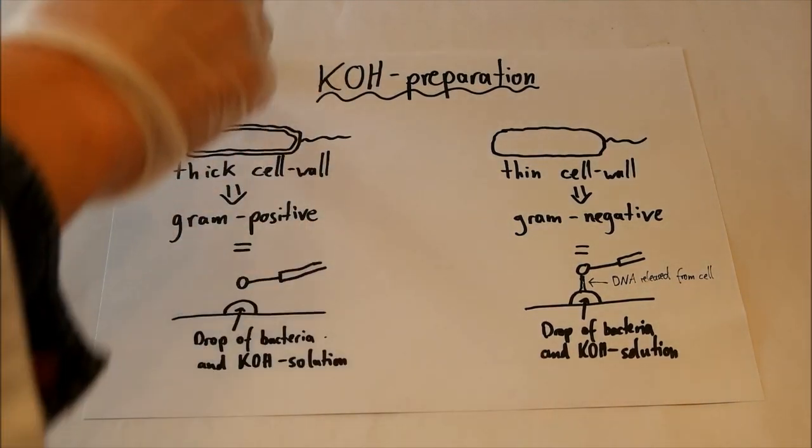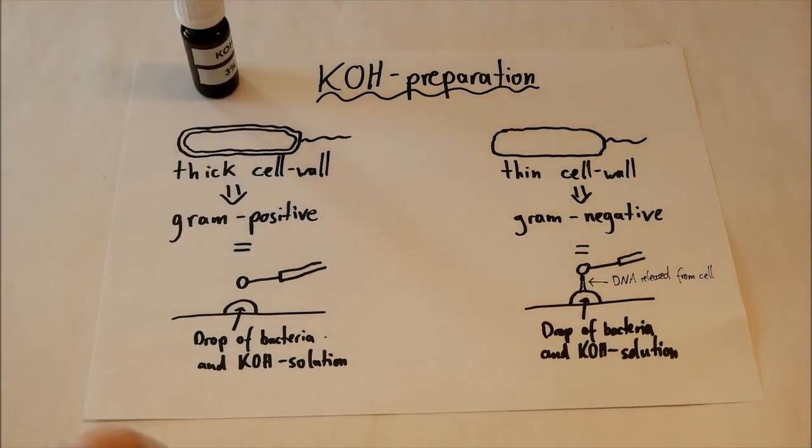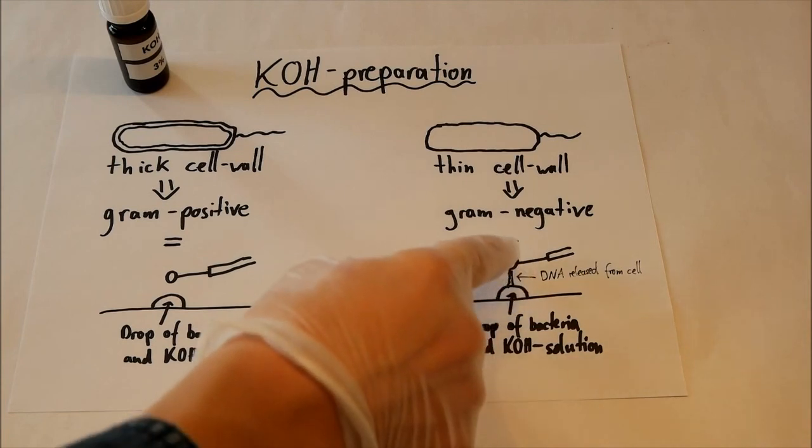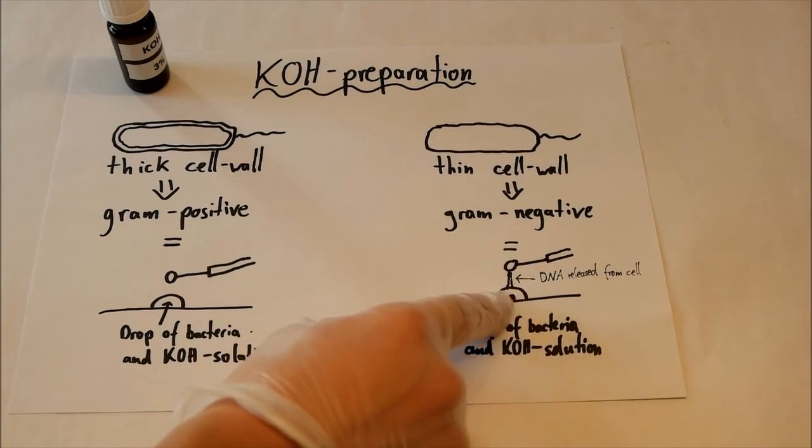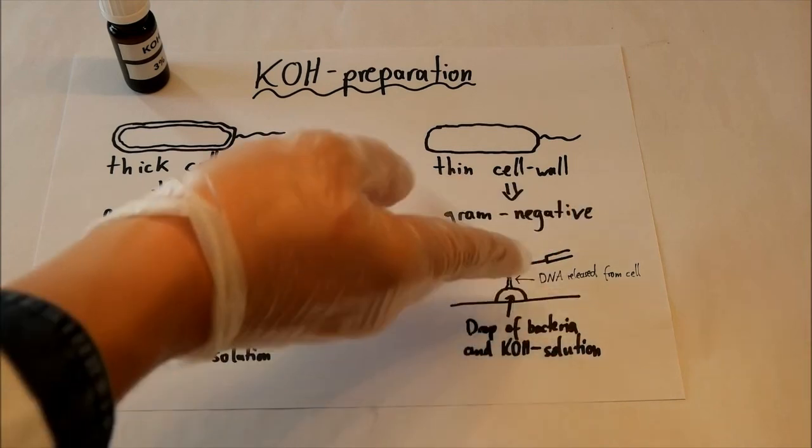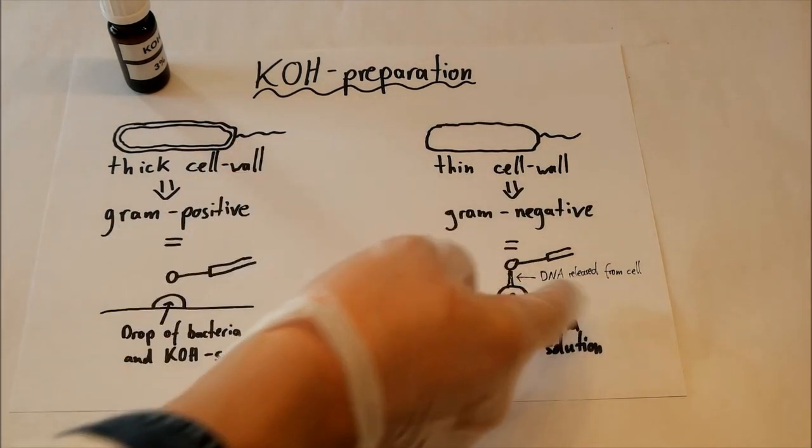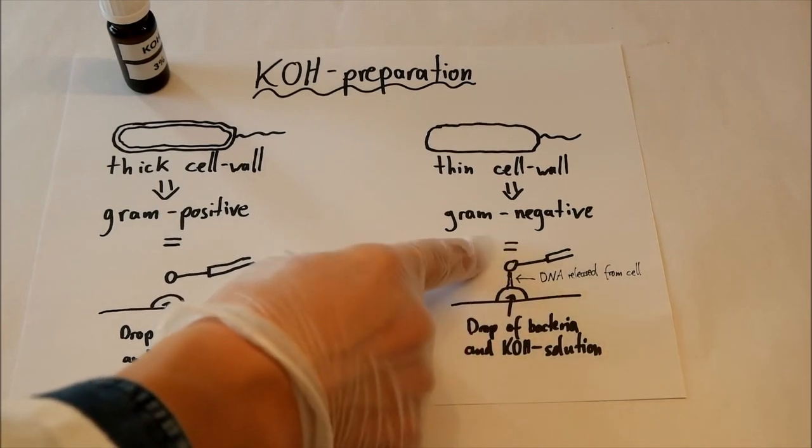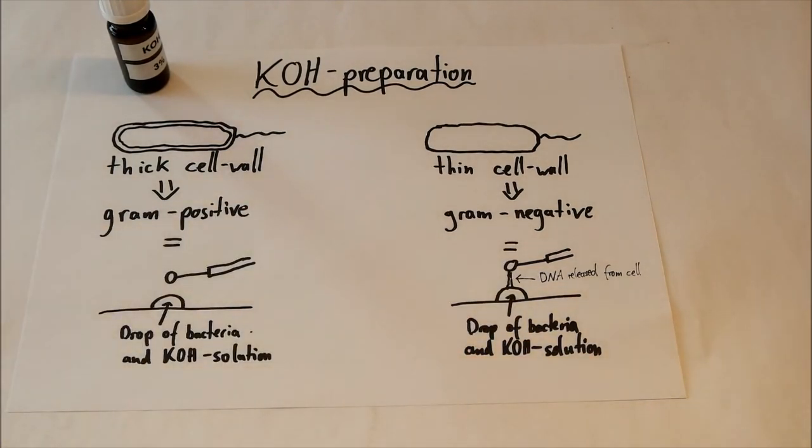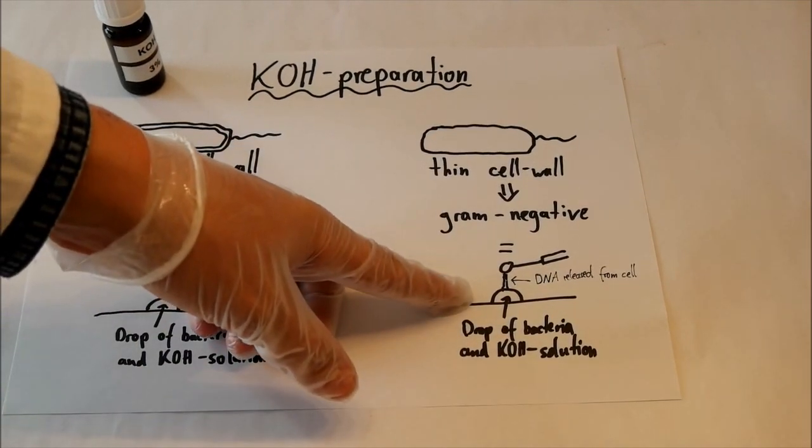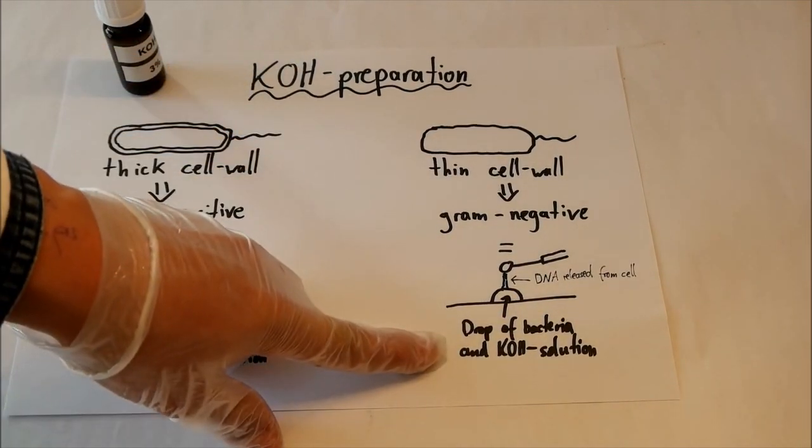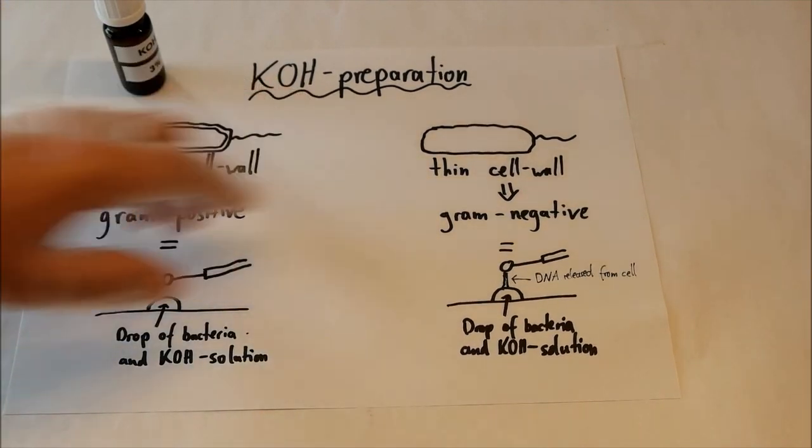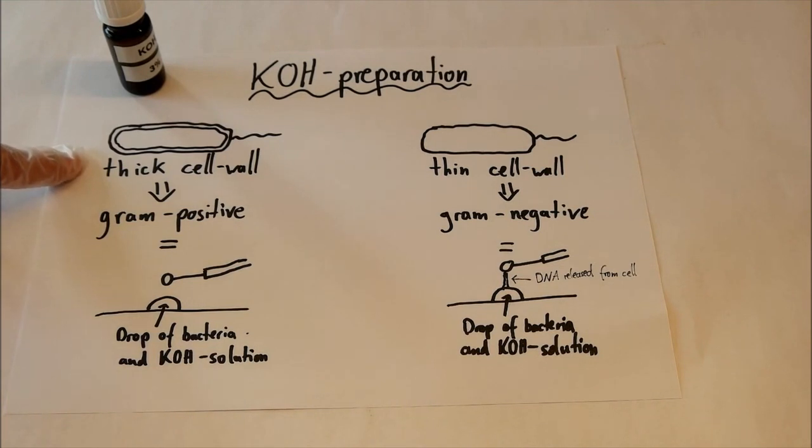So if you put a drop of the potassium hydroxide solution on your bacteria, and you stir it very well, and then you take your inoculation loop and take a piece of the drop up, there will be thin lines of DNA between the loop and the drop of bacteria and potassium hydroxide. This is because the potassium hydroxide can destroy this thin cell wall, but not the thick cell wall.